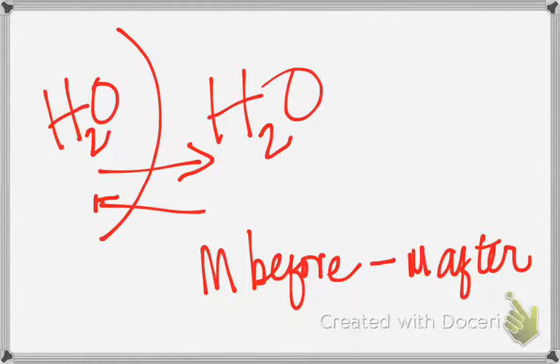Simple sugars. What did we use to test for simple sugars? Benedict's solution. So we could potentially test the inside of the egg to see if there was any sugar inside of the egg, right? Or we know if we put it in a sugar solution, there's sugar outside of the egg, so we don't need to test that. But we would want to test and see if there's sugar inside of the egg.